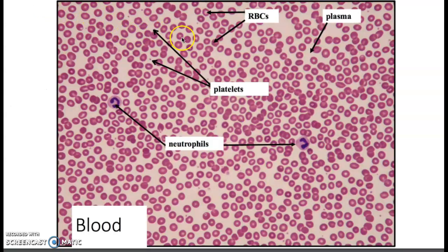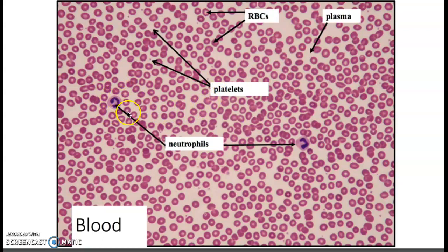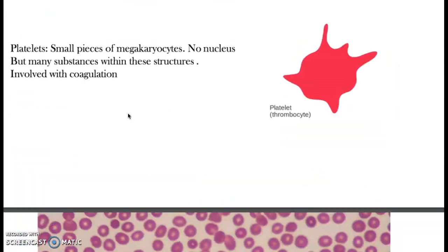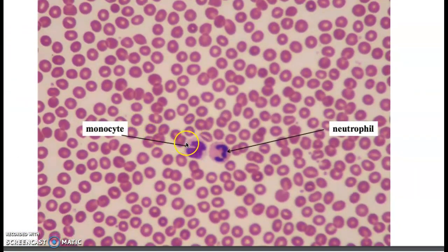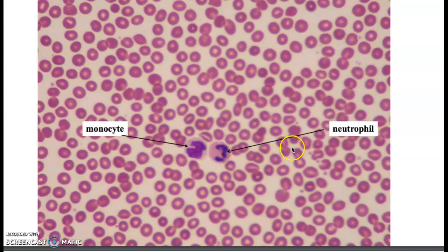Looking at some blood cells on the slide: we have red blood cells, which are the most abundant cells. We have small fragments — thrombocytes or platelets. Among the white blood cells, we can identify neutrophils with their multi-lobulated nucleus, and a monocyte with its kidney- or bean-shaped nucleus, as well as another polymorphonuclear or neutrophil.